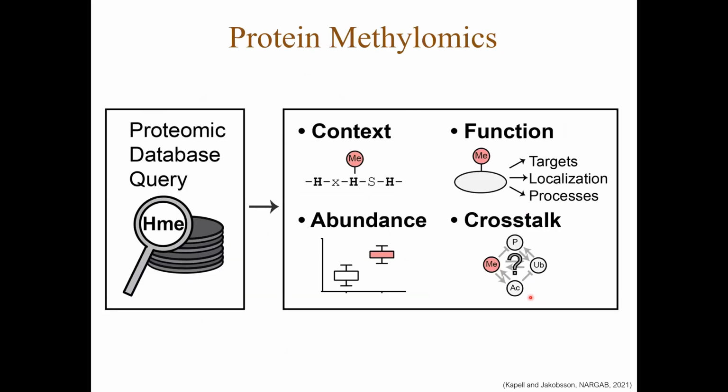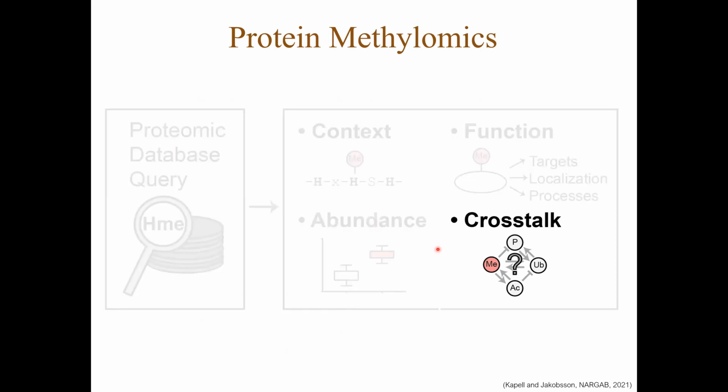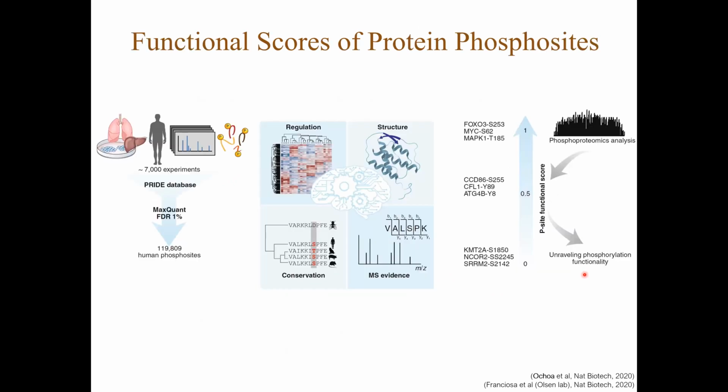All right, so now I've presented results from our protein methylomics study on histidine methylation and talked about the context, the function, and the abundance of these methylations. And now I will just show some of our analysis concerning PTM crosstalk and the interaction. And we explored crosstalk between histidine methylation and phosphorylation.